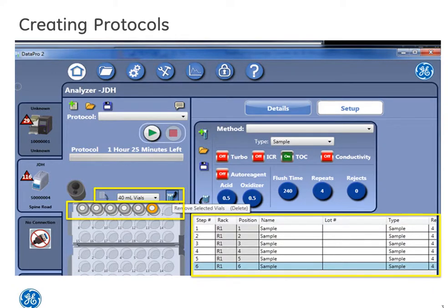You can also add or remove vials from the existing protocol by selecting one of these icons. And if you're ready to run your protocol, you can press the play button.